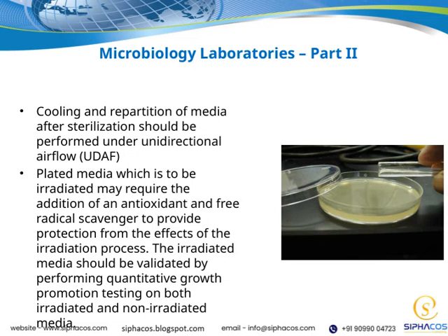When it comes to cooling and repartition of media after sterilization, it's crucial to perform these steps under unidirectional airflow, or UDAF. This helps ensure that the media remains sterile and uncontaminated during handling. For plated media that will be irradiated, we might need to add specific additives like antioxidants or free radical scavengers. These substances help protect the media from the potentially damaging effects of the irradiation process, maintaining its integrity and effectiveness.